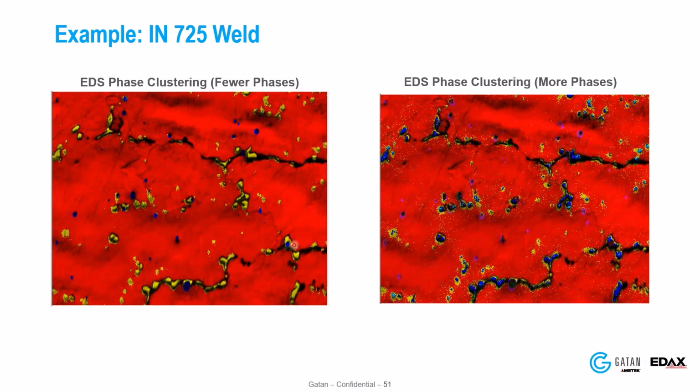There's some noise or boundary effects. EDS gets as close as it can, but as these features get smaller, it's never 100% satisfactory. So there are tools in the software to do EDS averaging, or to shift the EDS for changes in interaction volume. Lots of tools to improve it, but again, it's more work.